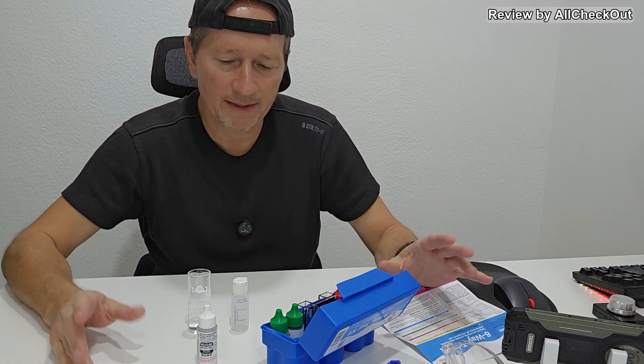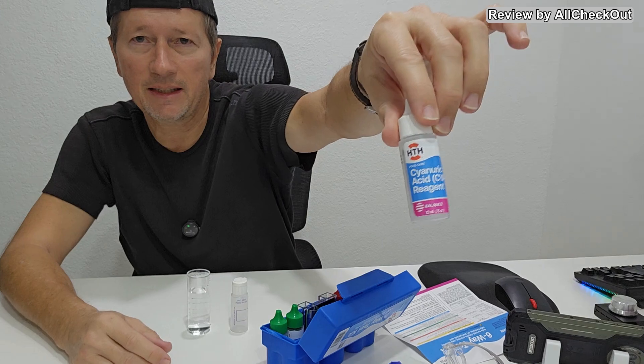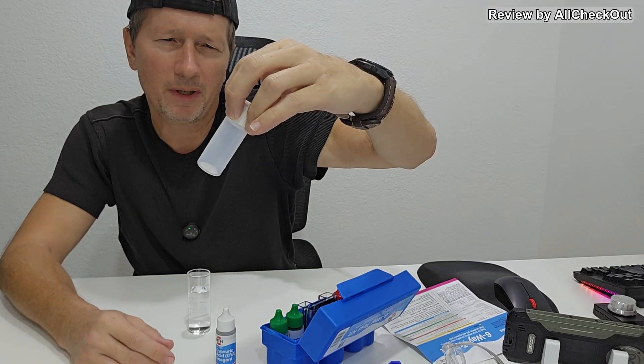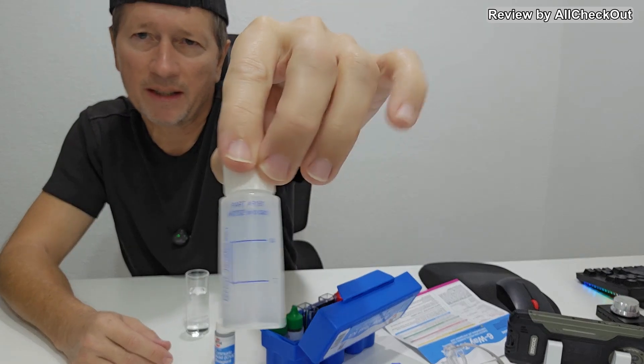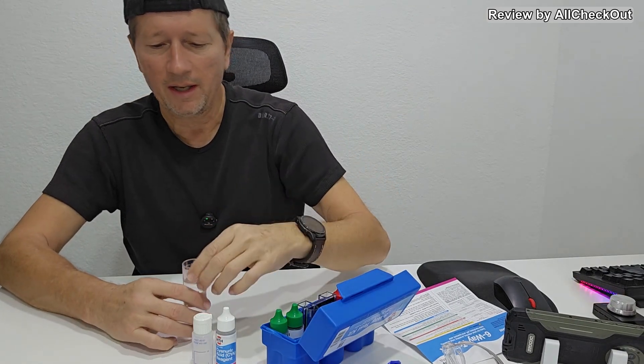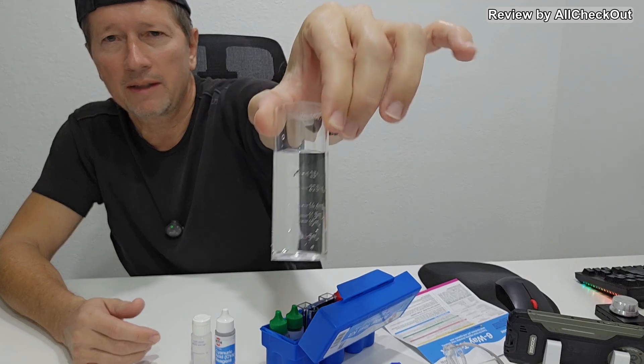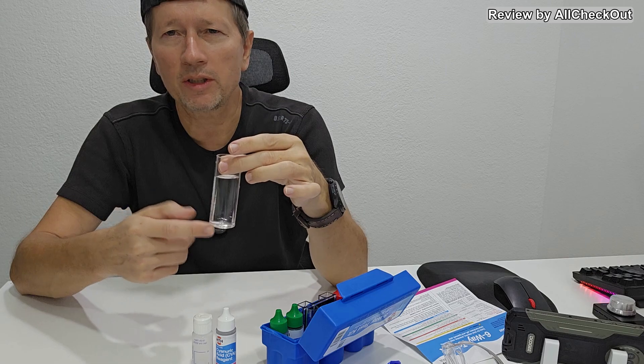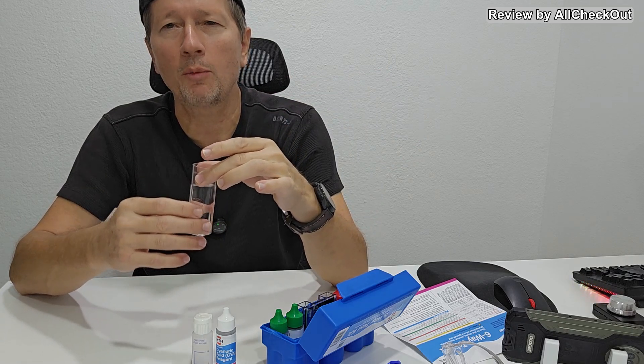So what we really need for the cyanuric acid test is this chemical here. We need this bottle, number 9191 described here on top, and I took also this cup here which is inside.